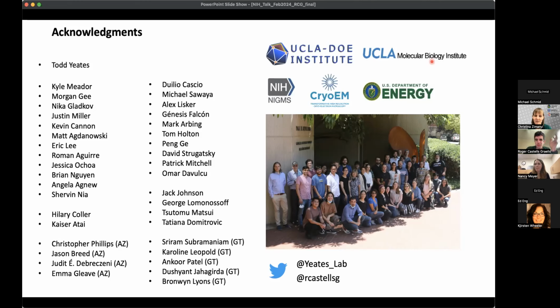I could go back into my notes, so if this person wants to contact me, I can then find the exact numbers. But we used pretty much default parameters, and then a lot of things would be influenced, for example, by the size of the mask, and also how good your starting data set was. It would be much easier to clean it. I think you're going to get somebody contacting you. So thank you for that information.